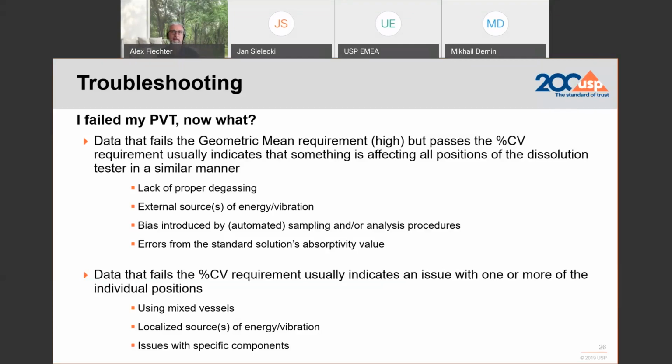If the CV fails high, then it could be an indication, as I said before, of the vessels. Despite they might all be within the acceptance criteria, if you use a range of vessels that qualify but vary in terms of design, that could be an indication. Vibration could be a source, and issues with other specific components.